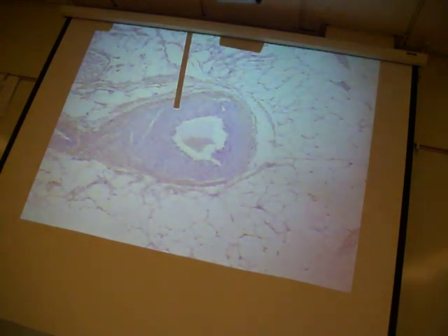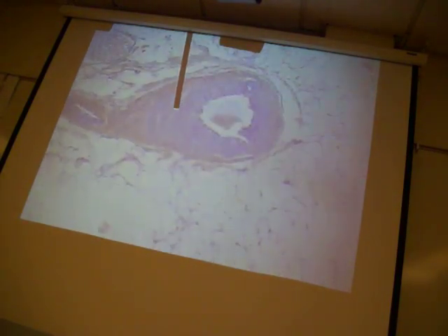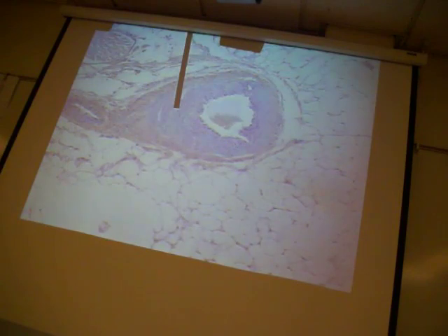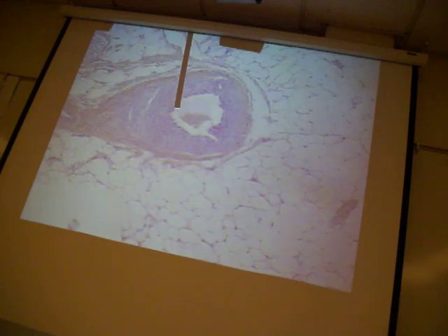And Ernest, how do I know this is an artery, not a vein? The thickness of the, I forget what it's called, but it's thick because there's a lot more pressure in an artery. Okay, this part right here, right? Yeah. Wait, who else has had anatomy in here? Lupe? Yeah. Oh, you're in anatomy. Yeah, I am. Okay. And so this is the tunica media, right? This is that smooth muscle. There we go. So I'm going to go right over here to this layer.